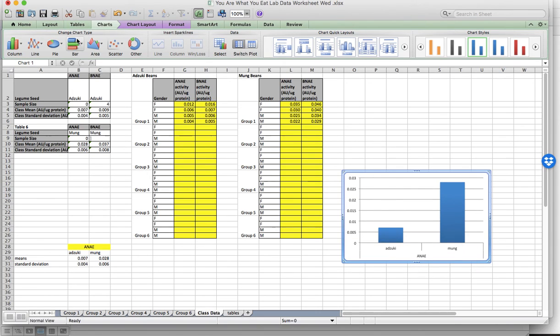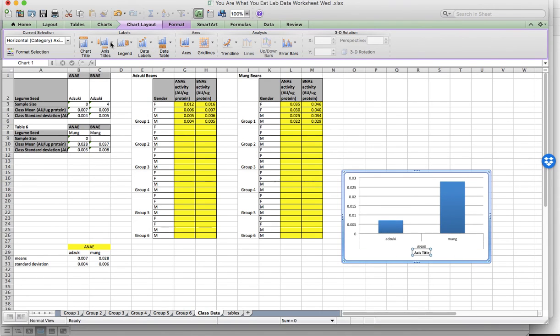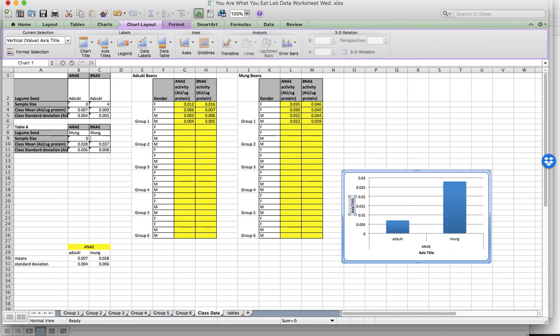So there's a few things that are missing. We are missing the error bars and the legends. The titles for the axes. So let's add it. So on the y-axis, we have the alpha naphthyl acetate esterase activity, and that's in units of absorbance per microgram of protein.